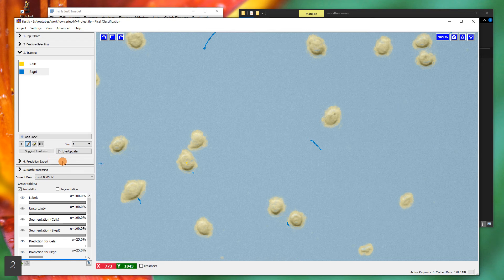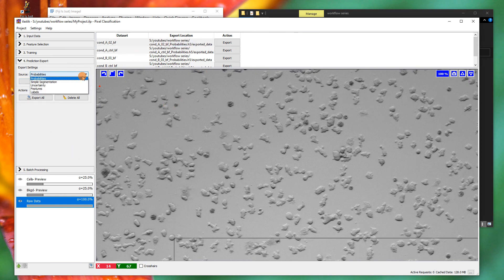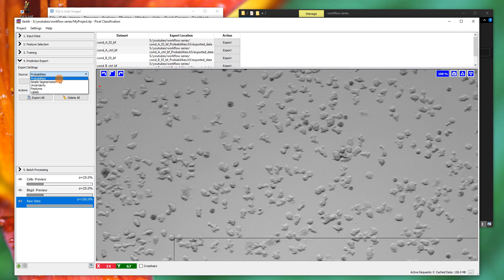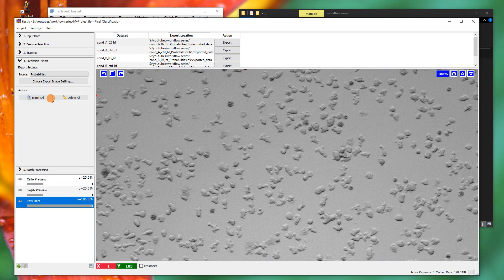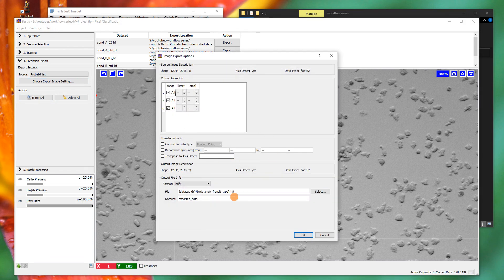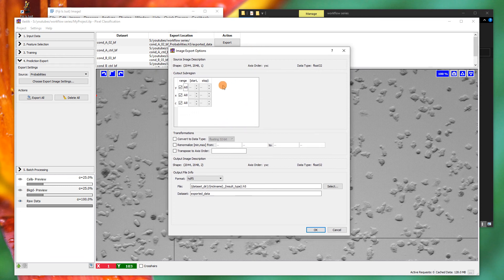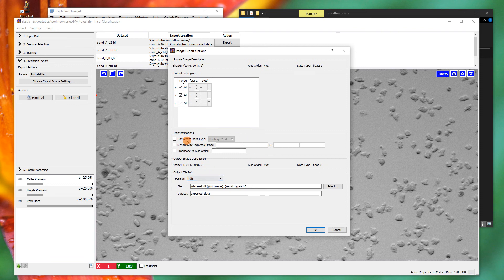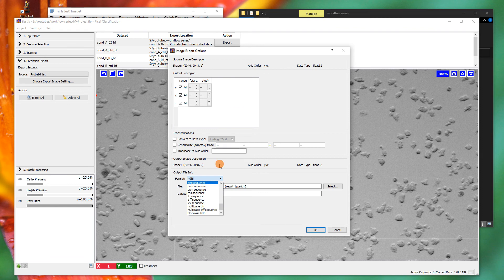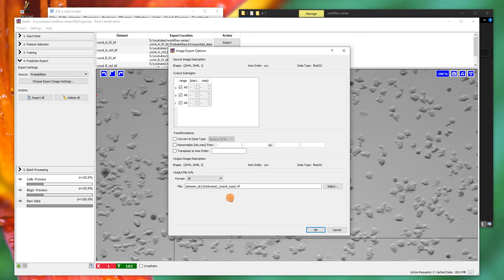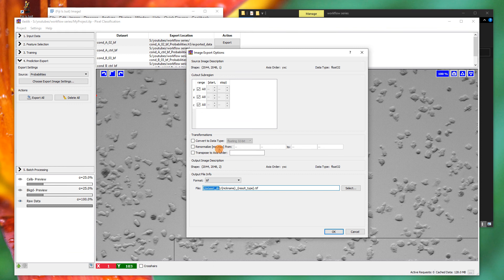On to the next section is the prediction export. We're going to export the probabilities. You can export different options there, probabilities of it being in class A cells or class B background. We're going to change the settings here. This particular window deserves almost a 10-minute tutorial on its own sometimes. We're going to look through some of the options and the export options here. Watch out for the different types of TIFFs and sequences. You have lots of different types and it depends on the dataset. We have a single image, we're going to export just to TIFFs, which is kind of the easy option. You'll see this is the dataset directory. This is where the files came from. The nickname is the name of the file, which is going to be here like condition A02, and the result type is going to be probabilities.